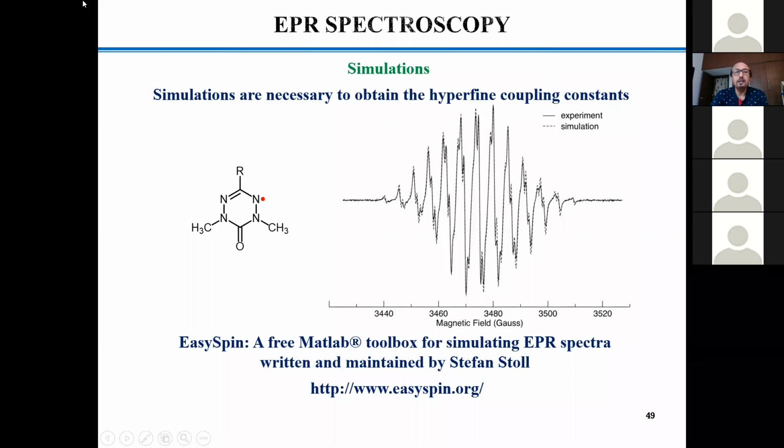Okay. Now, if you take this molecule, it's a very interesting molecule in the sense that you have many options in hand. You have got a spectrum with around 27, 28 peaks, if I am not wrong. You can count it: 1, 2, 3, 4, 5, 6, 7. This way I have counted it. You will get around 27 to 28 peaks. Now, how to interpret this? If you consider all the nitrogens are equivalent, then you should expect 9 lines, right? 2 into 4 into 1 plus 1, all N14, so 9 lines. But you are getting 28.